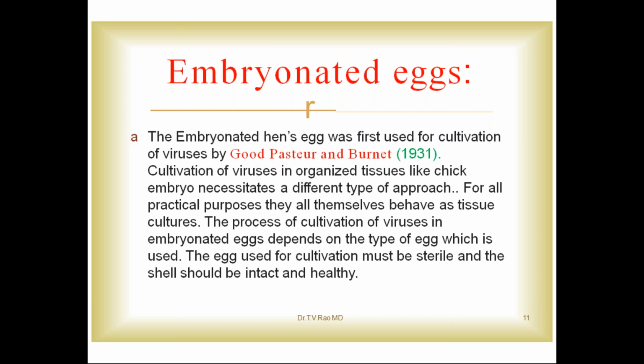The process of cultivation of viruses in embryonated eggs depends on the type of egg which is used. The egg used for cultivation must be sterile and the shell should be intact and healthy. It should be below 10 days old, with no bacterial contamination and no other virus contamination. Then only we can use the embryonated egg.